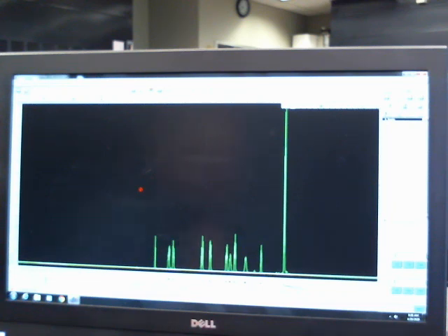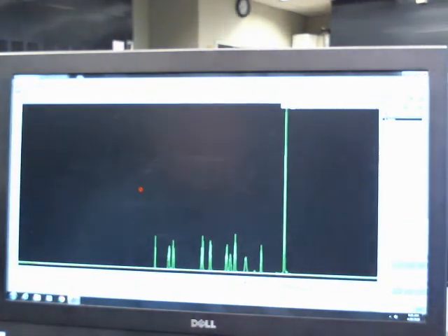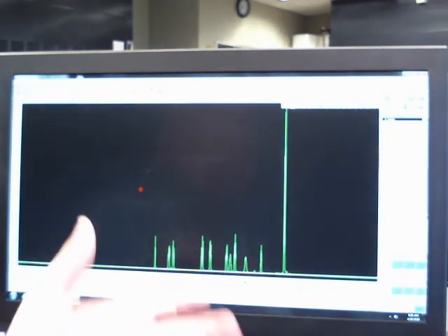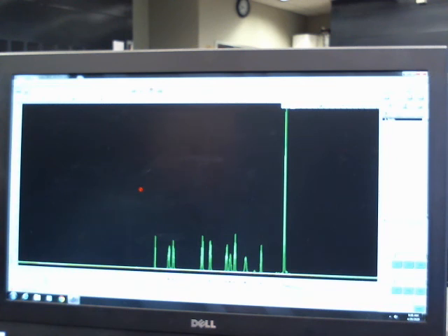All right, in this short video, I'm going to show the proton NMR of the Diels-Alder. I don't know whether it's exactly the same one that I gave you, because I'm here at school recording this, and I left the spectra back at home. But this is a proton NMR from one of the Diels-Alder products from a previous year.